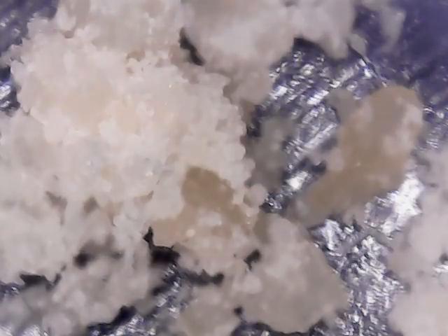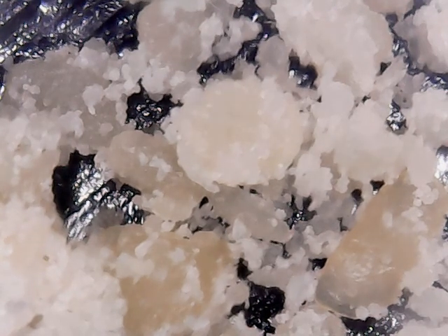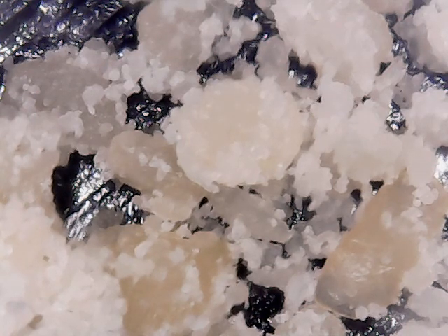Let me stop there and put the rest of the box over there. Can I put it more in focus or is that it? That's in the balance — obviously I'm going to get it. And then if I zoom in... I wonder what those are, because you see those big chunks, bottom right and then bottom left, kind of middle.